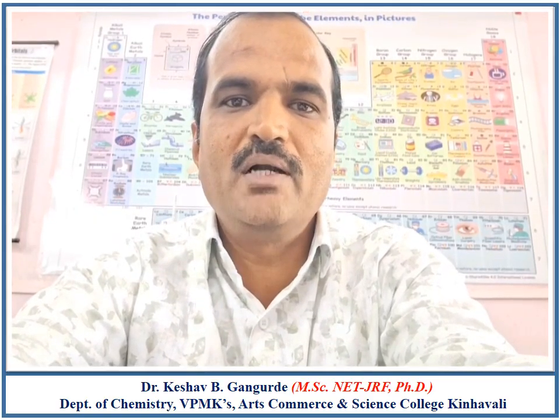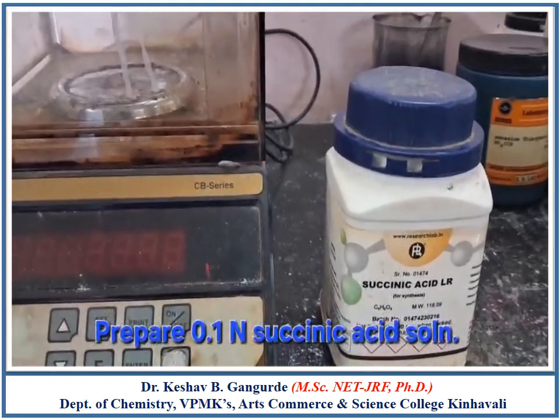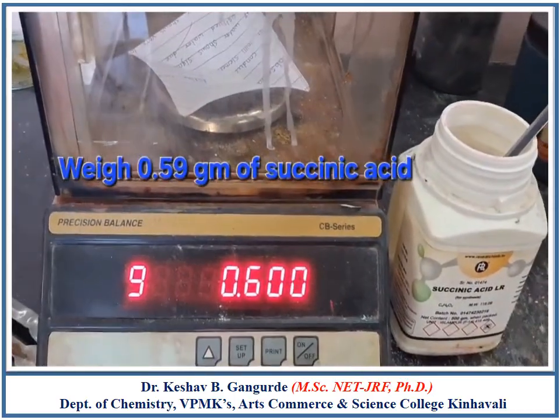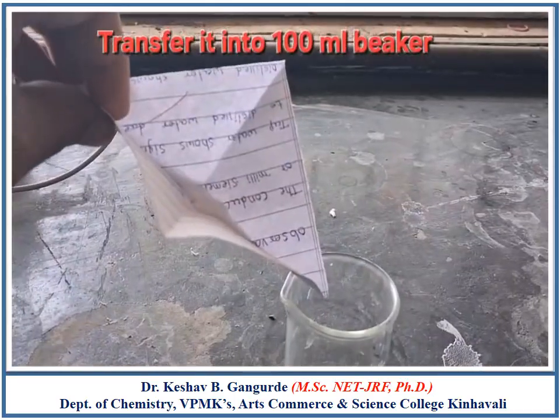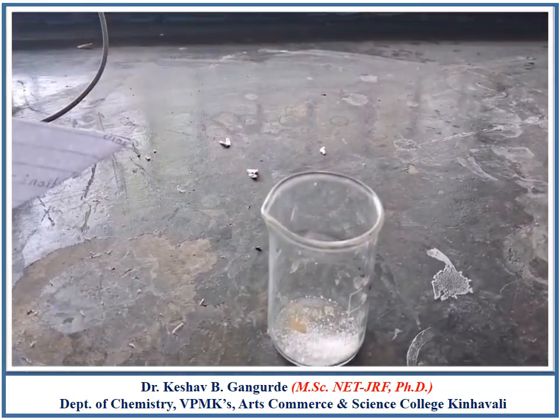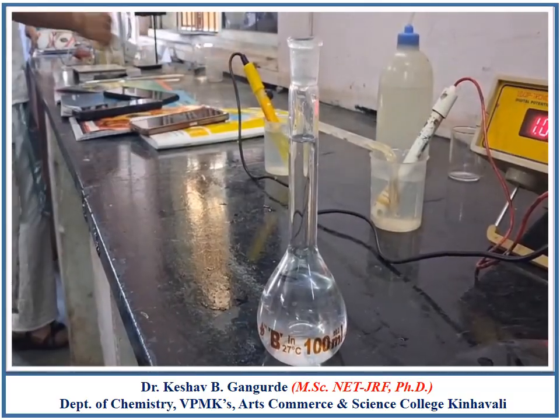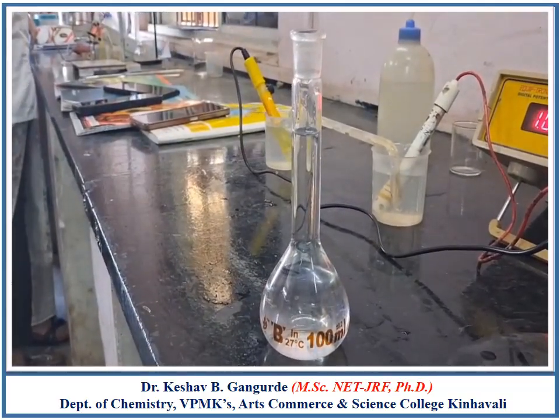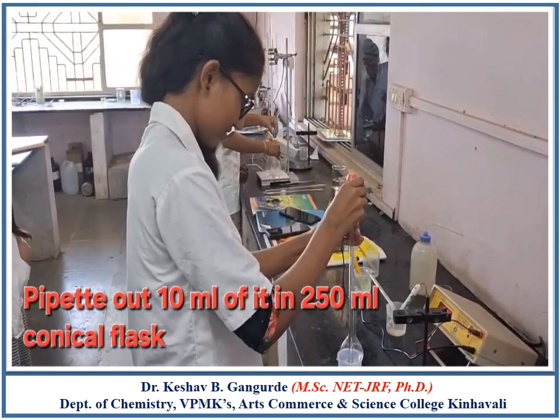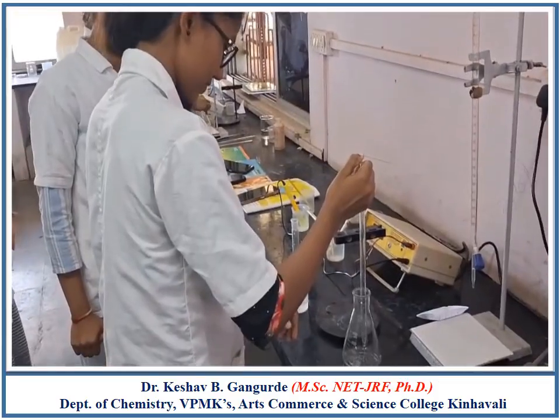Let's perform part 1, that is standardization of NaOH solution. Let's prepare 0.1 normal succinic acid solution. We have 0.59 gram of succinic acid. Transfer and dissolve it in minimum quantity of distilled water. Dilute it in a 100 cm cube standard measuring flask to get 0.1 normal succinic acid solution. Pipette out 10 cm cube of 0.1 normal succinic acid solution in a 250 ml conical flask.